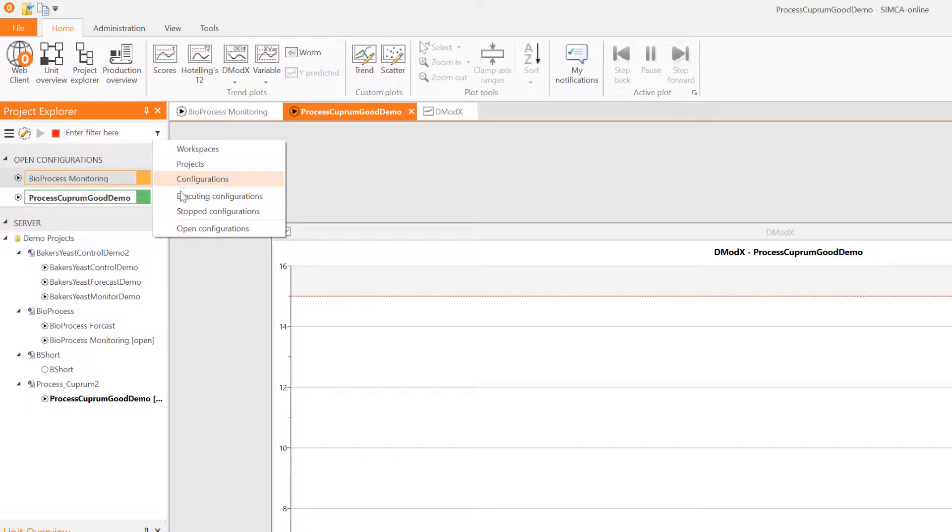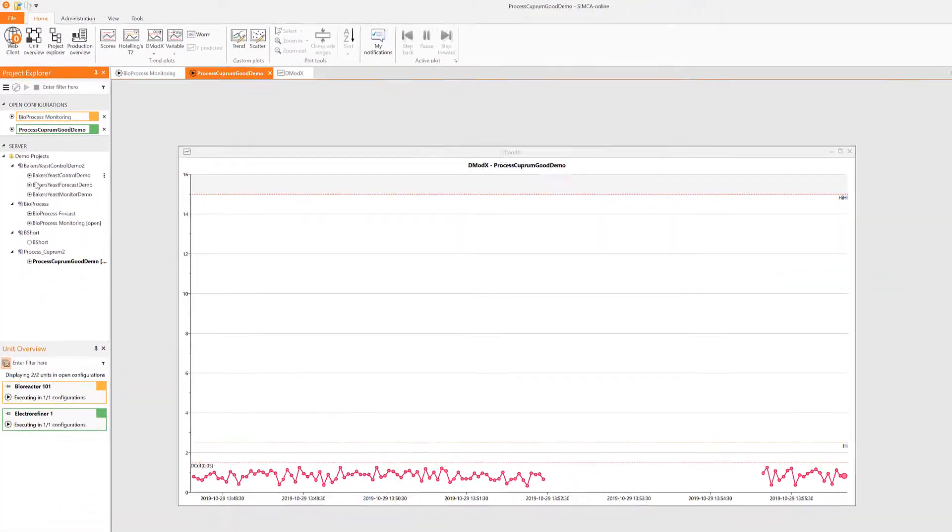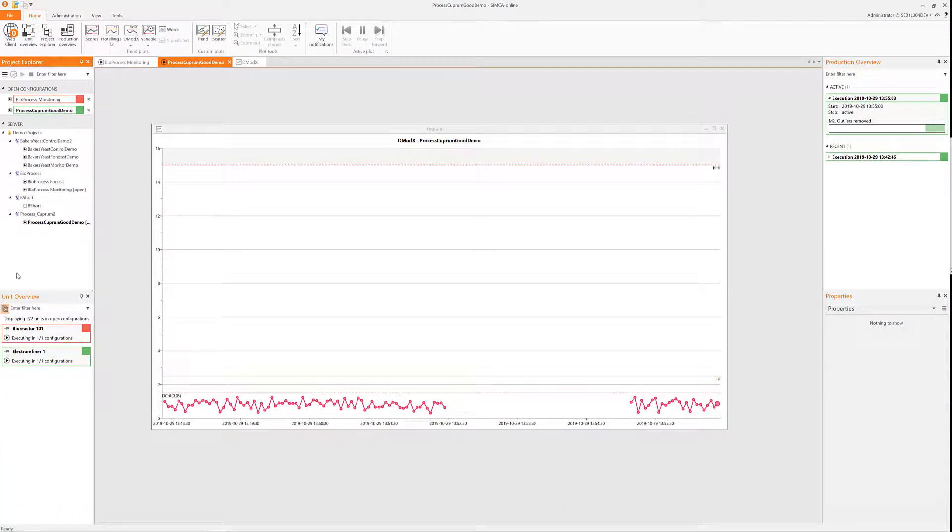In the project explorer there is a filter that helps you sort out the information in the tree that you are interested in.